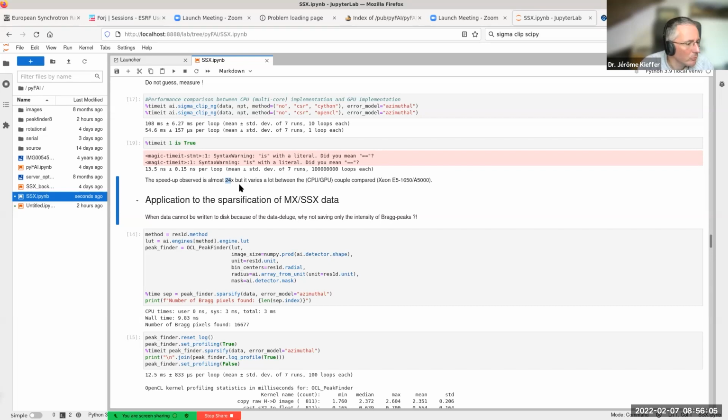By the way, did you try to run the calculation on GPU? For those who are trying to execute, does it run?